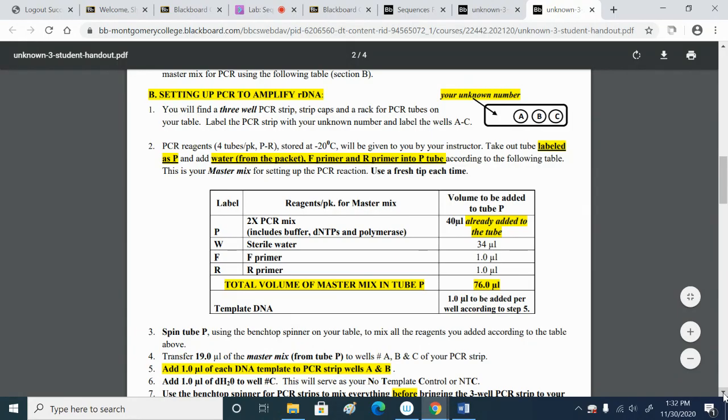Did it have to be used from like a special bacteria that could be heat resistant? Yep, so remember it came from a thermophile. So it's very heat tolerant. That's very important.